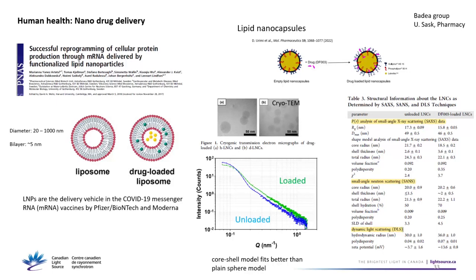But usually it's a complementary method. So they also combined small angle neutron scattering, dynamic light scattering, and cryo-TEM. All this information combined was used to characterize the particles. There's only so much information in one peak, so it's bound to be low resolution with a lot of hand waving.